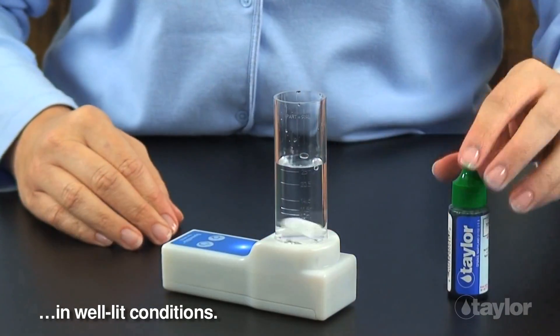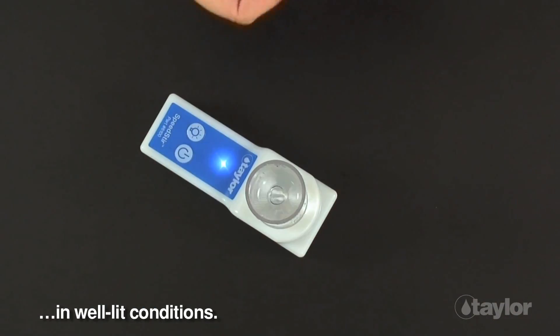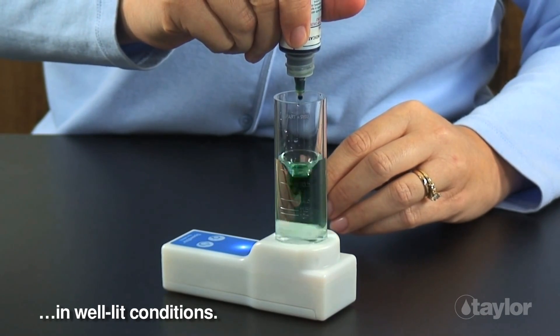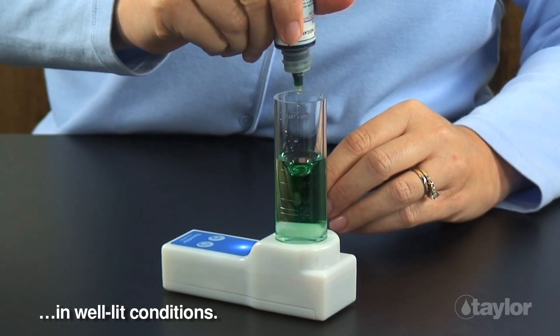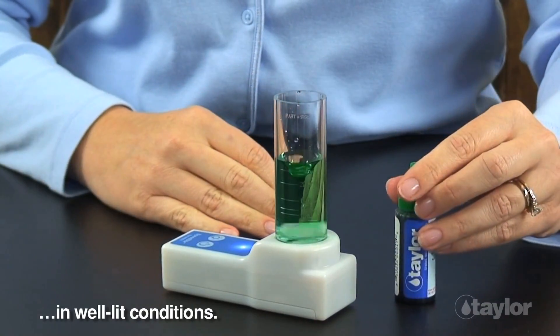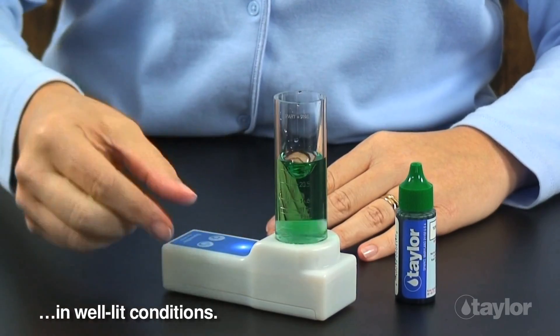Push the power button on the pad to turn the unit on in well-lit conditions. Add reagent drops as directed in your test instructions. Press the same button to stop the stirring action, or the unit will turn itself off after a minute.